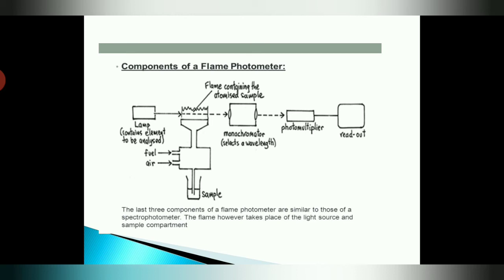In such cases, there is a gain in sensitivity. Generally here we are using a concave type of mirror. The concave mirror creates an inverted image of the flame, of equal size, at the location of the flame. This might be expected to double the light intensity. So to increase the light intensity, we are using the concave type of mirror.